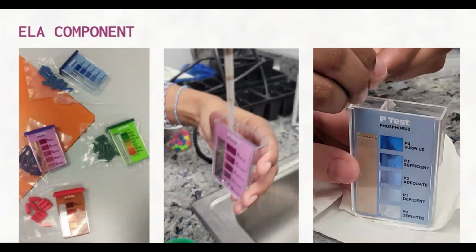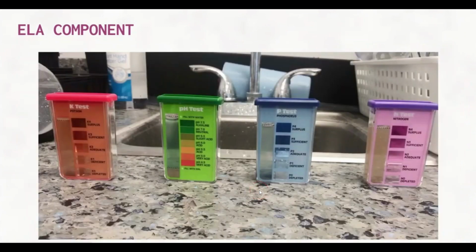We set up our soil and made sure not to shake it. We filled the testing containers with mud up to the indicated line for each test, and then filled the rest with water. Then we brought out the capsules needed for each test, cracked them open, and let the powder fall into the new soil solution. Then we all took turns shaking the testing container vigorously to ensure that the powder gave accurate results when mixed with the soil. We let the test sit in the classroom for a full day. Once the day was over, we took pictures of the results on the container.